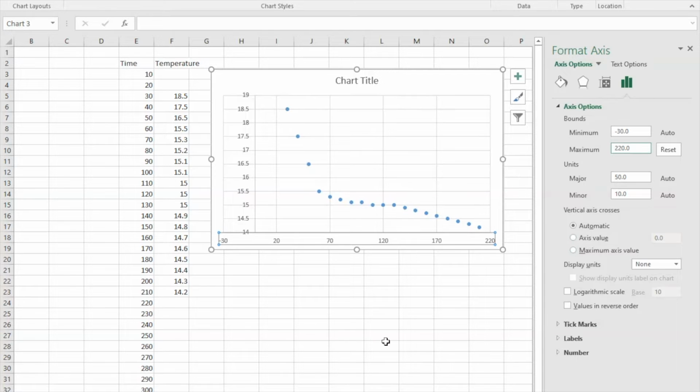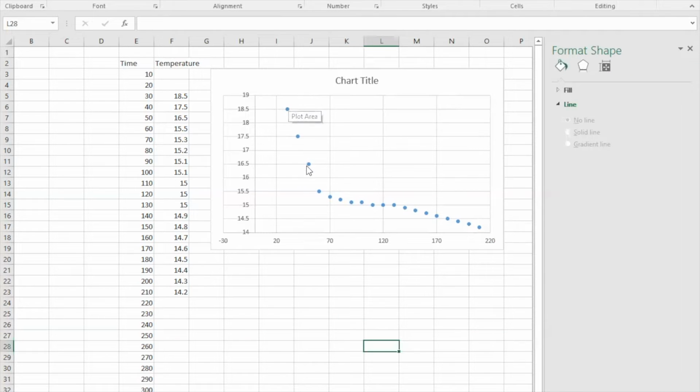Okay, now the idea for the mixture is that you have this first region where I wanted to show you how to create axis labels.